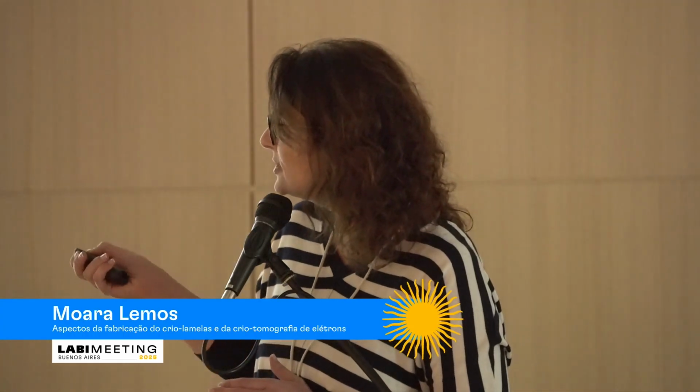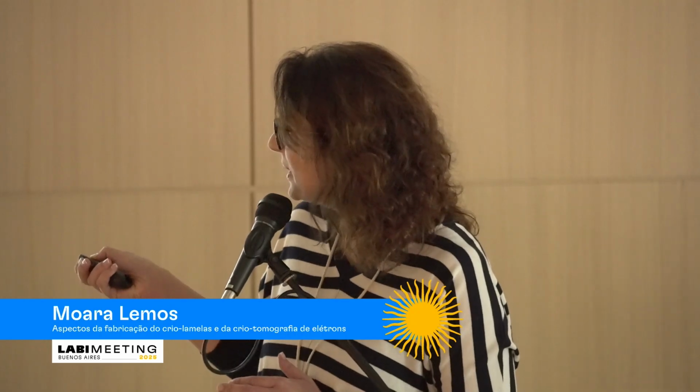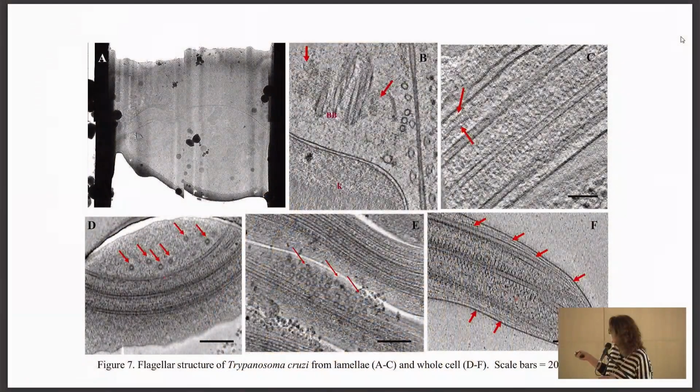And then we could see this region, which is the base of the flagellum, where we can see these intraflagellar trains being formed as small zigzag arrangements, shown here by the arrows. And then along the flagellum, between the axoneme and the flagellar membrane, we see longer trains sandwiched between the flagellar membrane and the axoneme.